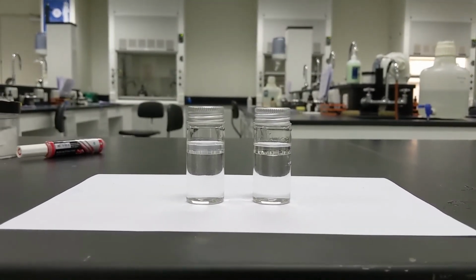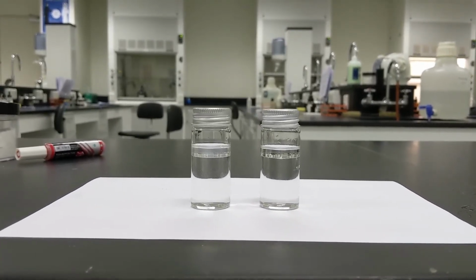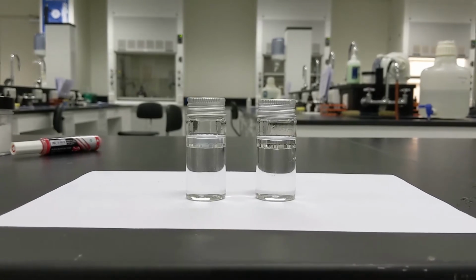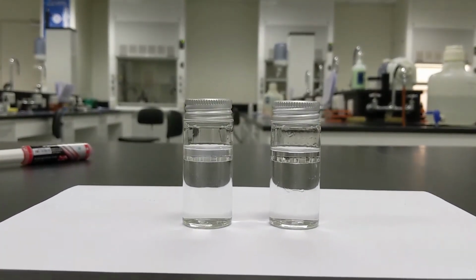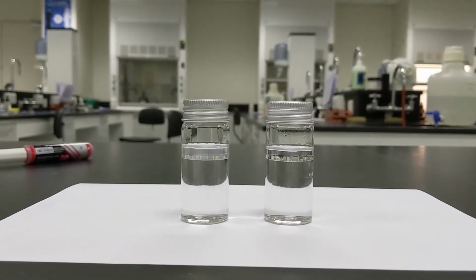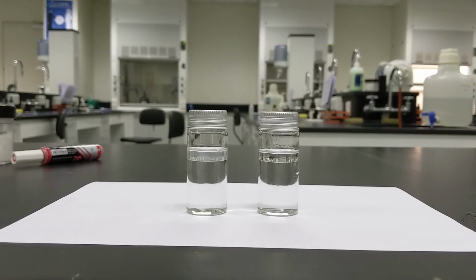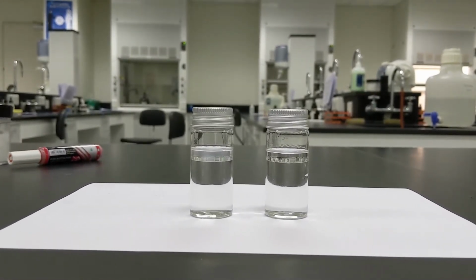I'm going to move into the next section in our course where we're looking at the properties of surfactants and what they could do for emulsions. Now, this is not an emulsion, this is not a solution or a homogeneous solution, this is a heterogeneous solution. So I'm going to see what happens when I add 2 different chemicals to these.